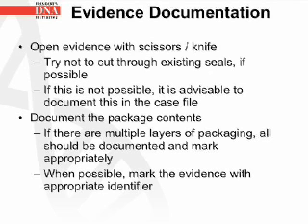Open evidence with a scissors or knife. Try not to cut through the existing seals if possible. If this is not possible, it is advisable to document this in the case file. Document the package contents. If there are multiple layers of packaging, all should be documented and marked appropriately. When possible, mark the evidence with the appropriate identifier.